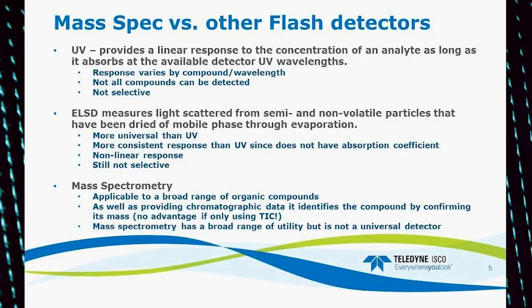Obviously, because there are compounds that do not ionize, such as hydrocarbons, it's not a universal detector. Unfortunately, there's really no good universal detector for liquid chromatography or flash chromatography today.